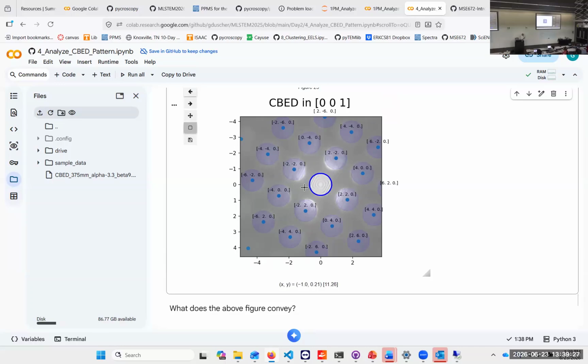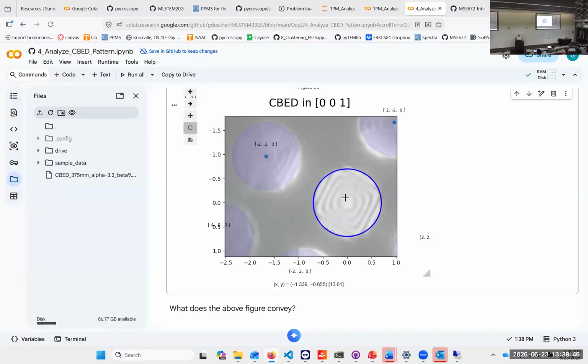Another way of determining the reciprocal space here would be, as we did it implicitly here, we went from, okay, let's select two deflections here. So we went from the center to the center, and we know this G vector. So that's in principle what we did.